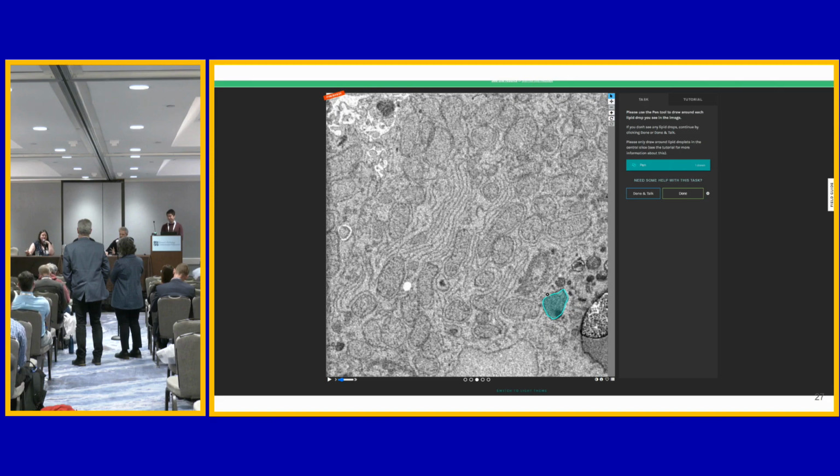And there's also something that is currently called the Broad Bioimage Benchmark Collection, though we're hoping for BINA to adopt it, and then we're probably going to go to B4C, because the Broad Bioimage Benchmark Collection name is kind of out there.